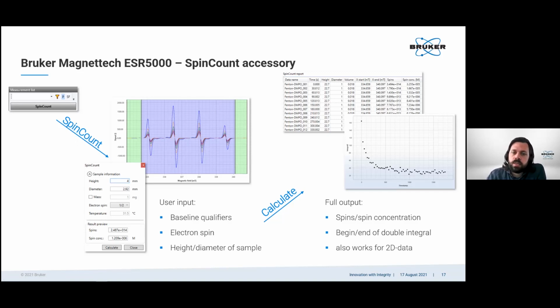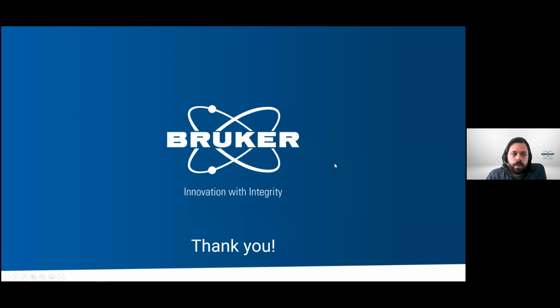Another possibility is to use the inbuilt evaluation function of ESR Studio. Here, for example, the double integral is plotted as a function of the time. And you can see here nicely the exponential decay. So with this, I'm at the end of my talk. I would like to thank you for your attention, and I'm happy to answer questions. Thanks.